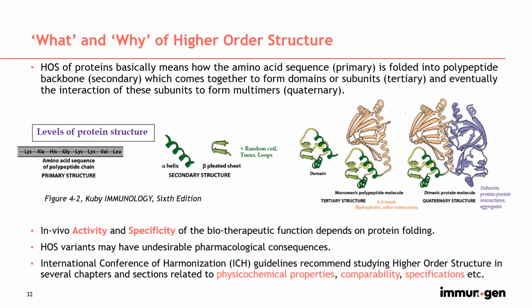For any biotherapeutic, the in vivo activity and specificity depend upon the protein folding as defined by the higher order structure. In the case of an antibody, the conformation directly determines its ability to interact and bind with its target antigen.